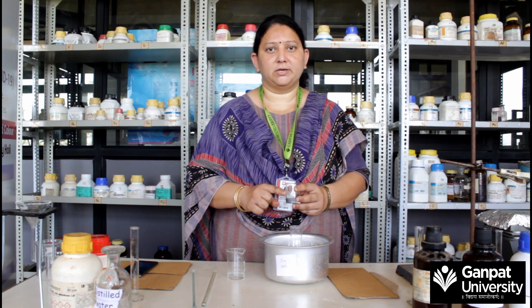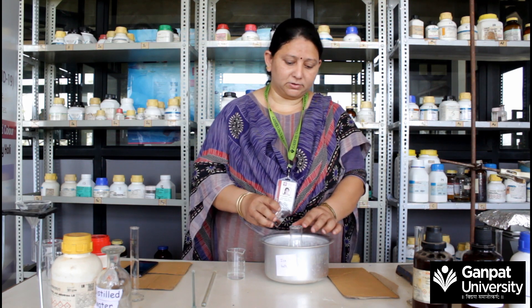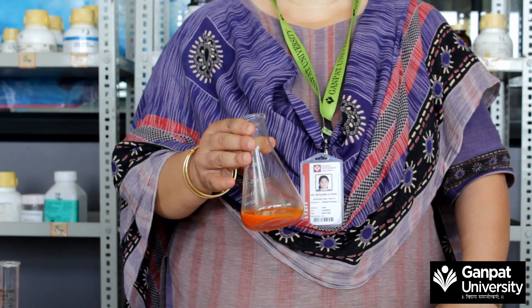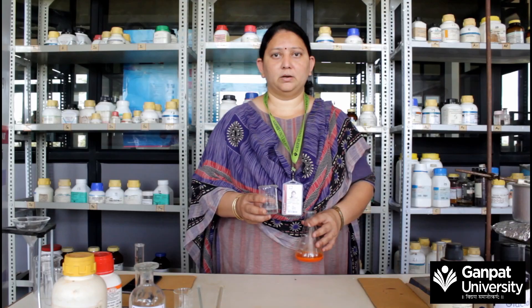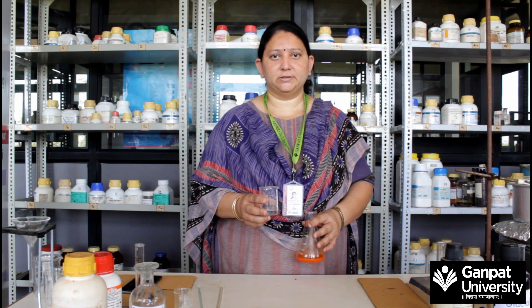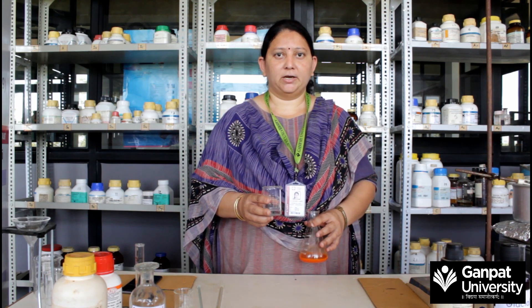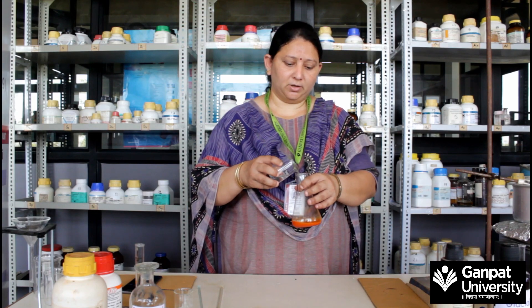Also add 30 grams of crushed ice dropwise into this solution. After that the mixture becomes a red-orange color. Now add a mixture of N,N-dimethylaniline and glacial acetic acid into this mixture slowly.